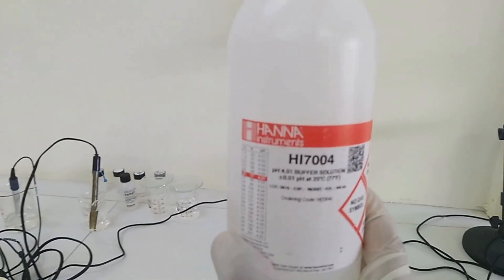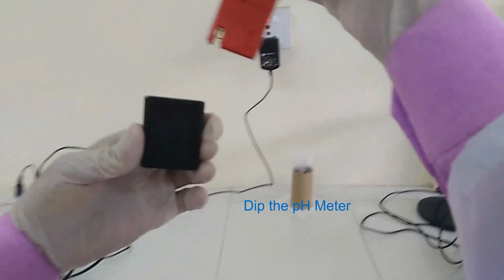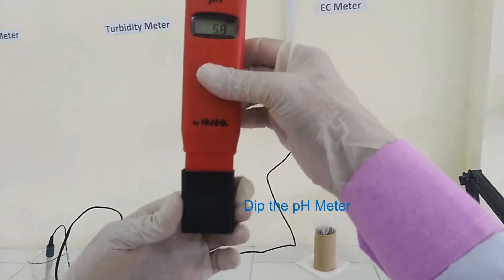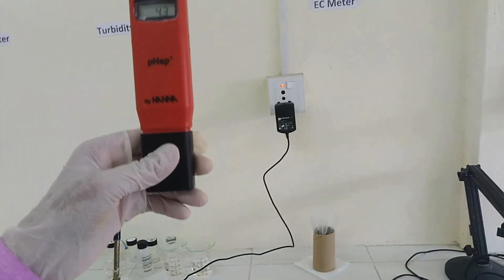Now take buffer solution of pH 4.01 in cap and dip the pH meter. Again wait for stable reading.